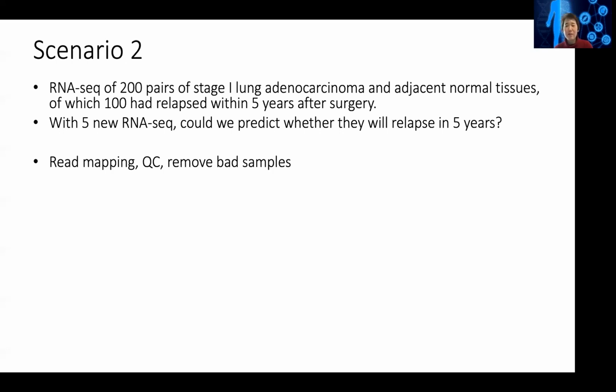You can just get 5 million reads to run STAR and to run RSeQC, because it will give you a pretty good idea what the quality of the sample is. And then you can run Salmon directly on the overall FASTQ samples, and that will save you a lot of computational resources.